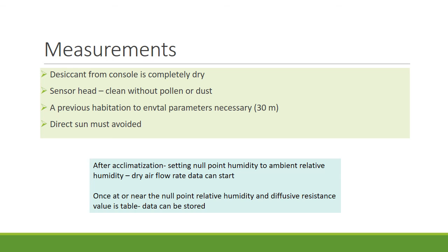can be done. Once finished the acclimatization, and after calibrating the relative humidity sensor and setting the null point humidity to ambient relative humidity and the dry airflow rate entering into the chamber, data recording can start. Along this time, we can display the parameter values of our interest.